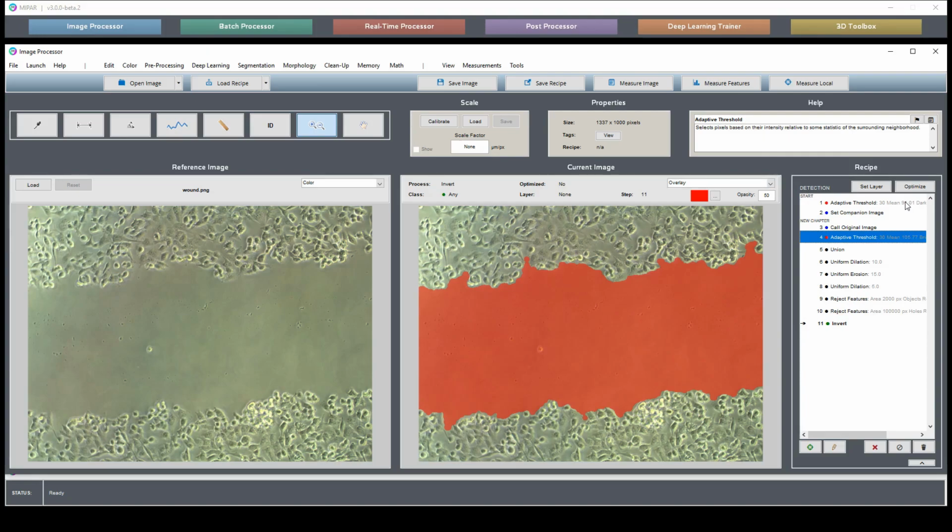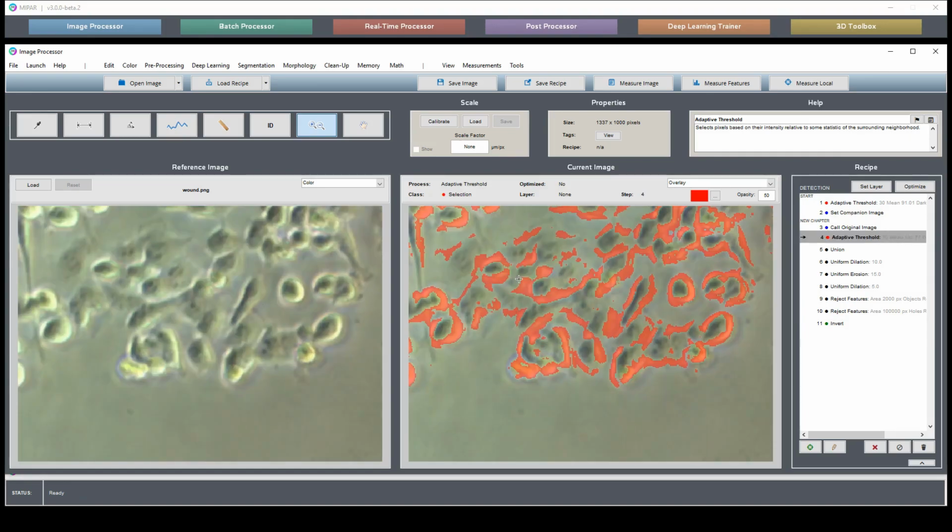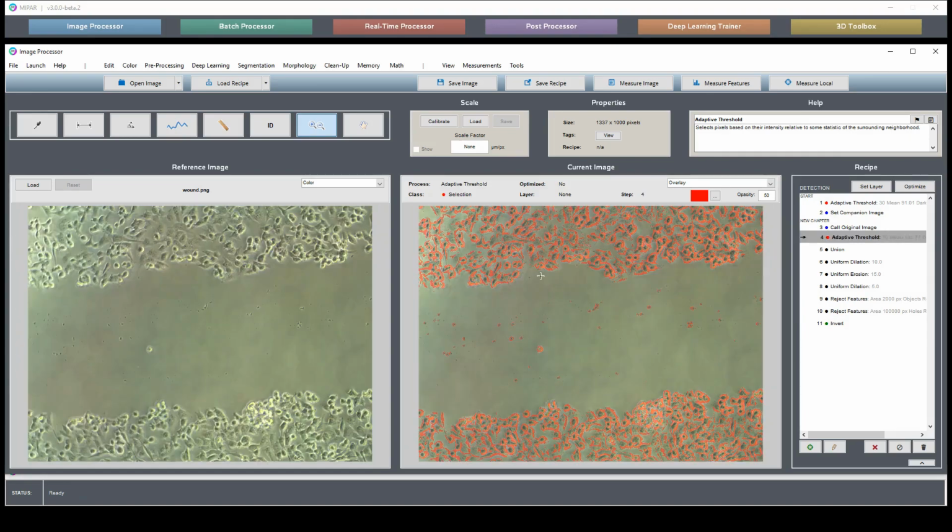And so when you start getting large images, say 300 megabyte images, and you start having to do larger and larger windows, they start to take up a lot of time. Plus we have to do them twice. We have to do a dark selection and a light selection. It'd be nice if we could just get some sort of method that is able to select both at the same time and not require multiple passes.